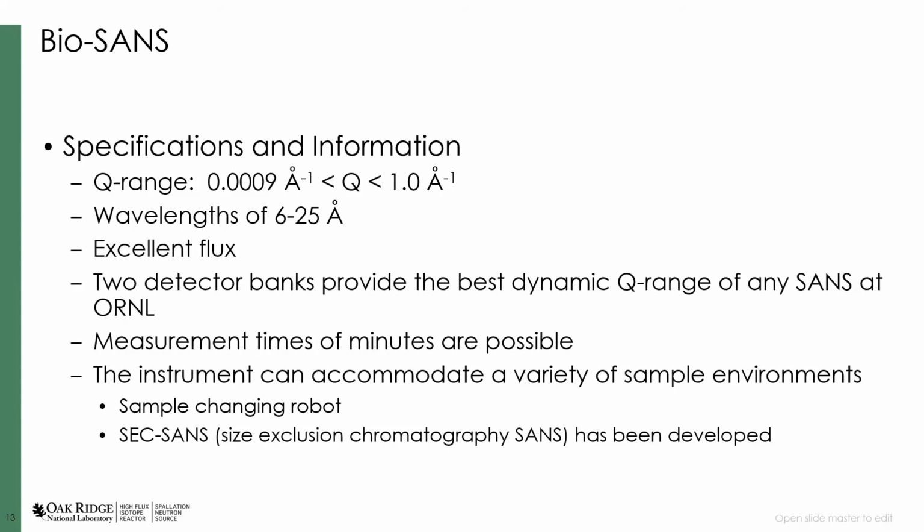So the instrument can handle a variety of different kinds of sample environments, but because its mission is centered around biology, because it's funded by the DOE BER, it tends to focus on a more compact area of science than necessarily you would see on the GP SANS instrument, which is there to serve anybody and everybody.